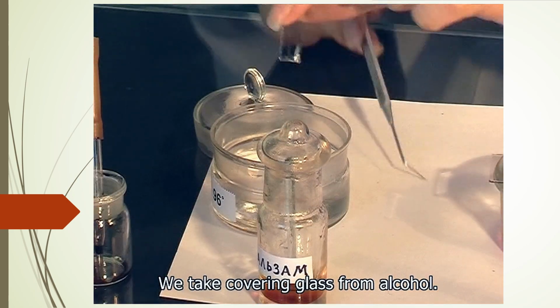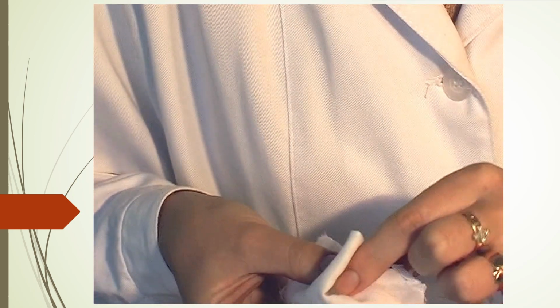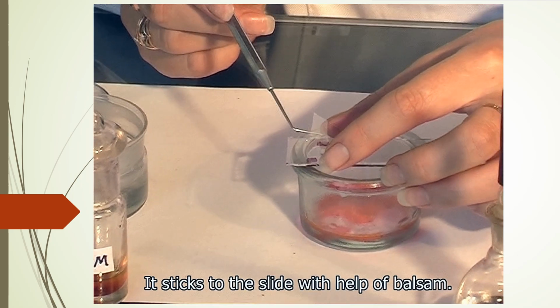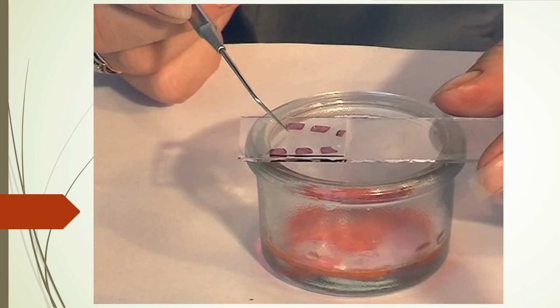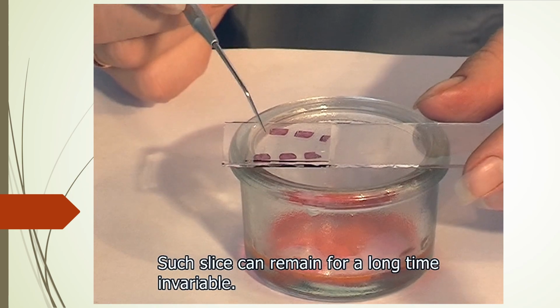We take covering glass from ethanol. It sticks to the slide with the help of balsam. Such a slice can remain invariable for a long time.